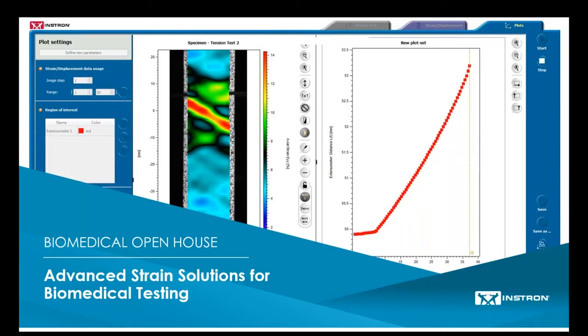For this session we will be covered by Dan Raynor, Instron's Product Manager for Strain Measurement. Dan is going to discuss many of the common challenges in biomedical testing applications that can necessitate the use of more advanced solutions with strain measurement. This will also include an overview of digital image correlation software, or what we call DIC, for generating full field strain and displacement maps for materials and component testing.